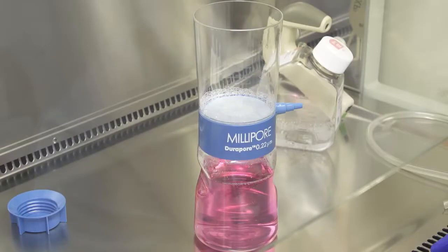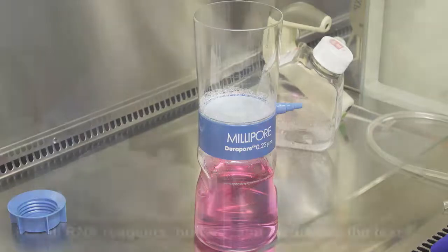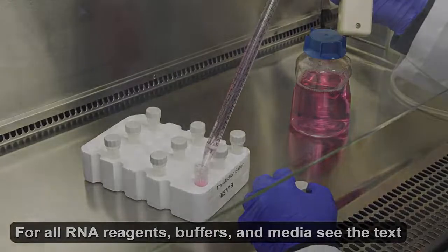Use a 0.22 micrometer vacuum filtration system to filter-sterilize the transfection buffer. Aliquot the sterilized buffer into 5 milliliter tubes with minimal air space.